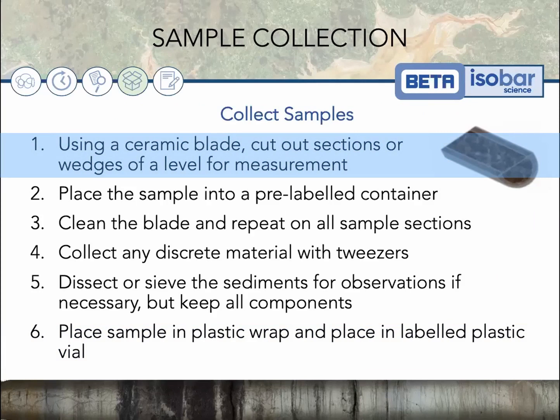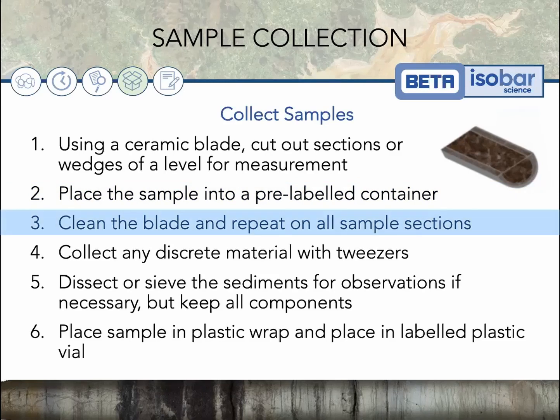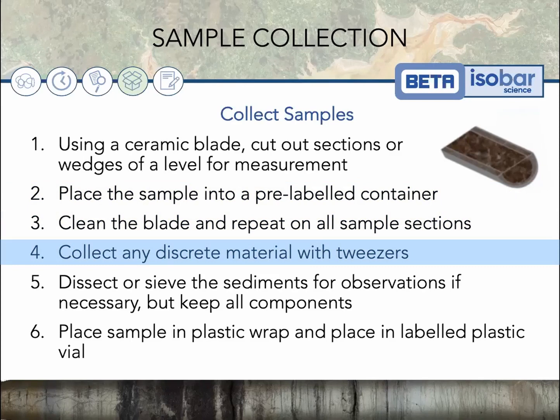Next, use a ceramic blade to cut out sections or wedges at different levels depending on the measurement you're interested in. Place each sample into a pre-labeled container. Clean the blade after each cut and repeat on all sample sections. Make sure you also collect any discrete material with tweezers.